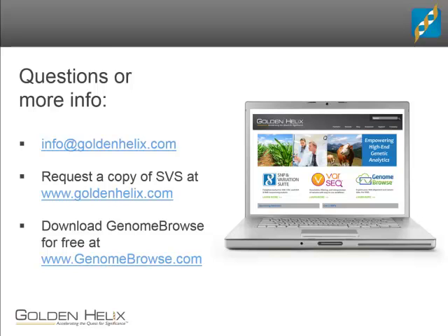Can we use this analysis procedure to analyze GWAS data? That's another question that comes up from time to time. It's the reverse of the question proposed in the webcast of can you use GWAS methods for sequence data? Can you use sequence methods with GWAS data? I hesitate to say too much there. Certainly within the software, there's nothing that will prevent you from doing so.